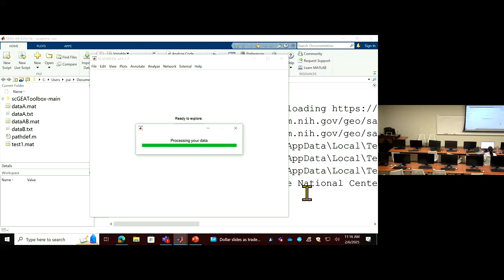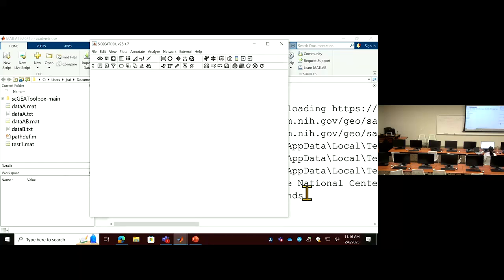So really, the input browser for loading the GEO numbers is just a command to get the software to wget those links, right? Yeah. Okay, cool. It's a very good feature to have. It makes life easier. That's right. Especially if you want to explore a lot of published data very quickly, you don't do anything, you just use the interface to see if there is anything interesting by yourself. So it's a set-it-and-forget-it type of feature. Yeah, yeah.